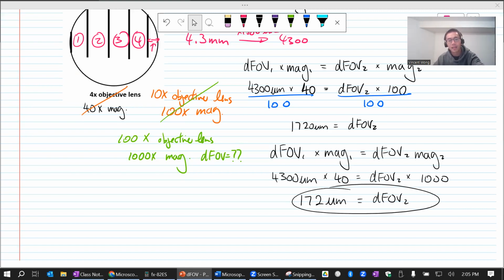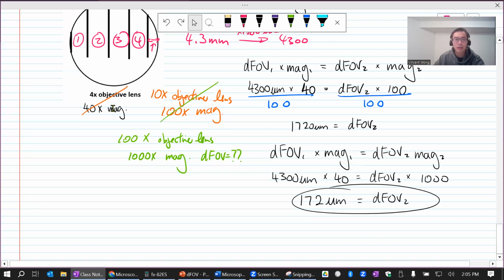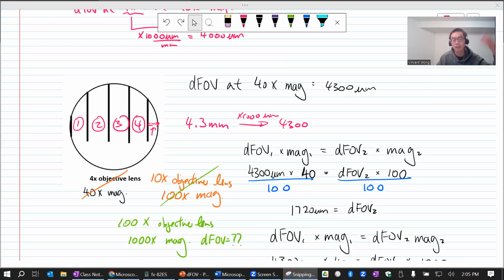I'm so sorry to take you back. I don't understand this calculation. I understand the later part, but at the beginning, how did you get 4.3? Remember, we are just counting the empty spaces. So you understand how there are 4 gaps here? 1, 2, 3, 4. And then this little gap here, how much do you think this is? It's less than half, right? It's probably less than half. So that's why I say 0.3.